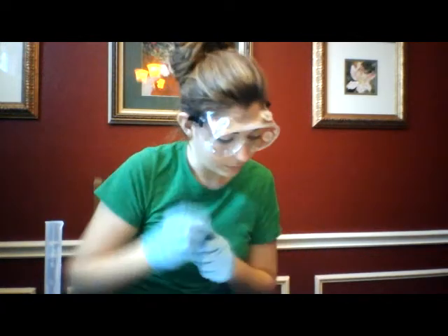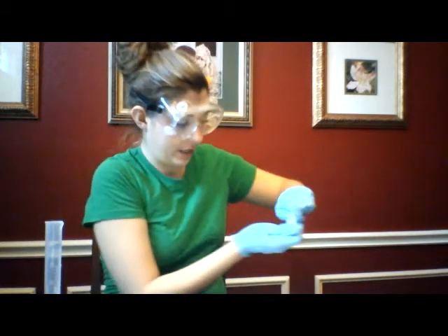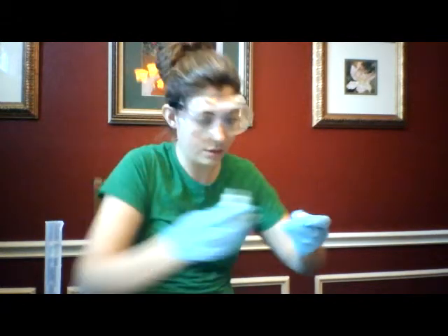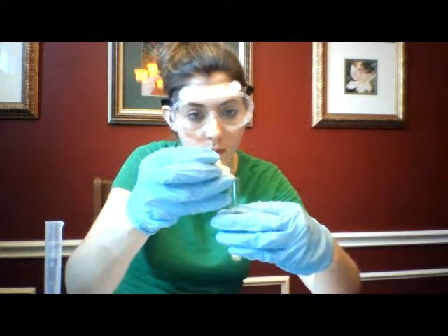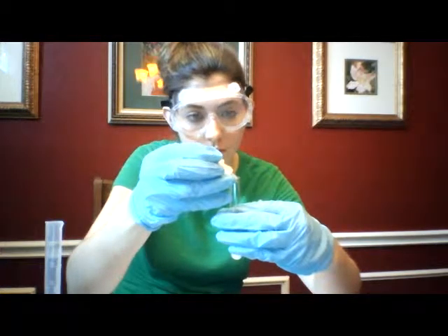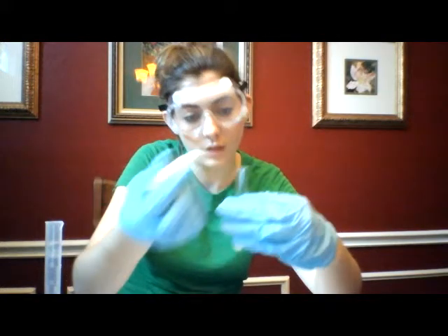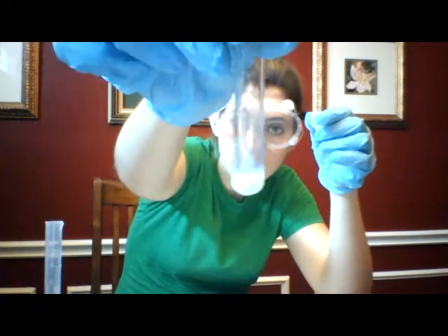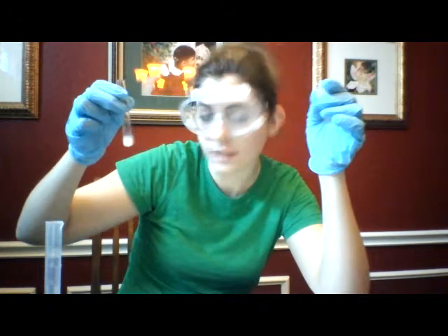I'm going to add 8 drops to that. Alright, and there is a reaction there. Went from clear to kind of cloudy, and honestly I might even say there's a bit of a yellow color to it instead of just white. So there was definitely a precipitate there.